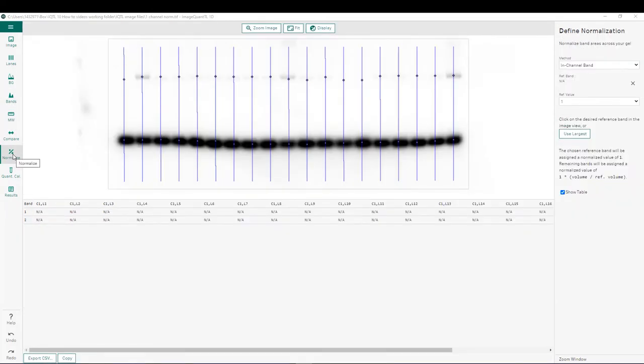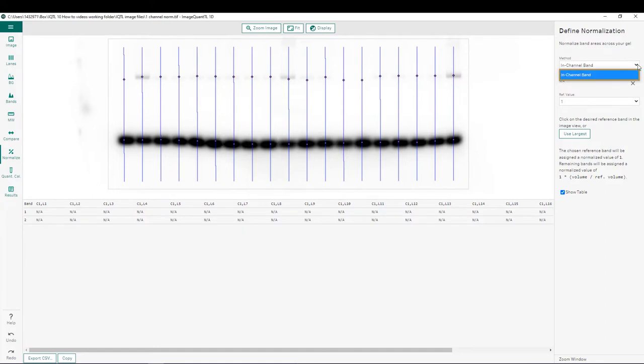Now that we are at the normalization step in the analysis workflow, we can first choose which method we'd like to use for normalization. From this pulldown, you can see we only have one option for in-channel band, and that's because we're analyzing a single channel image.